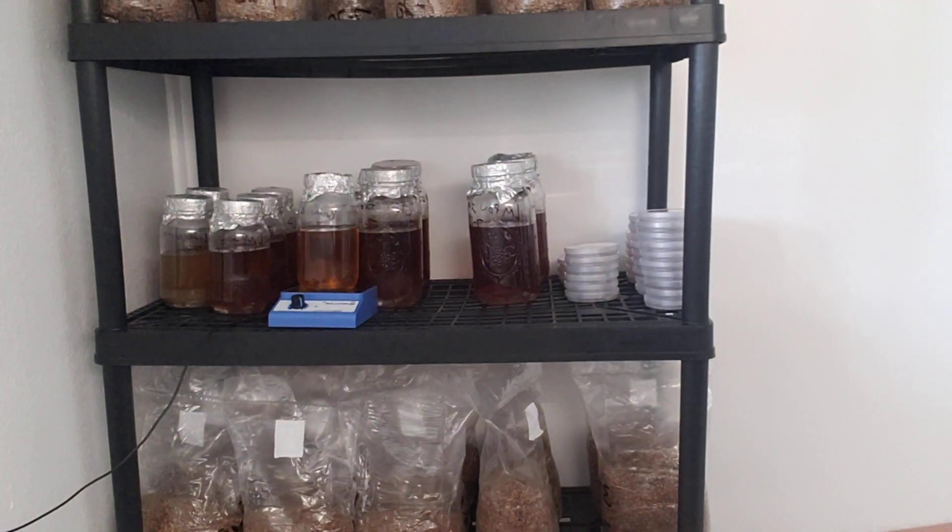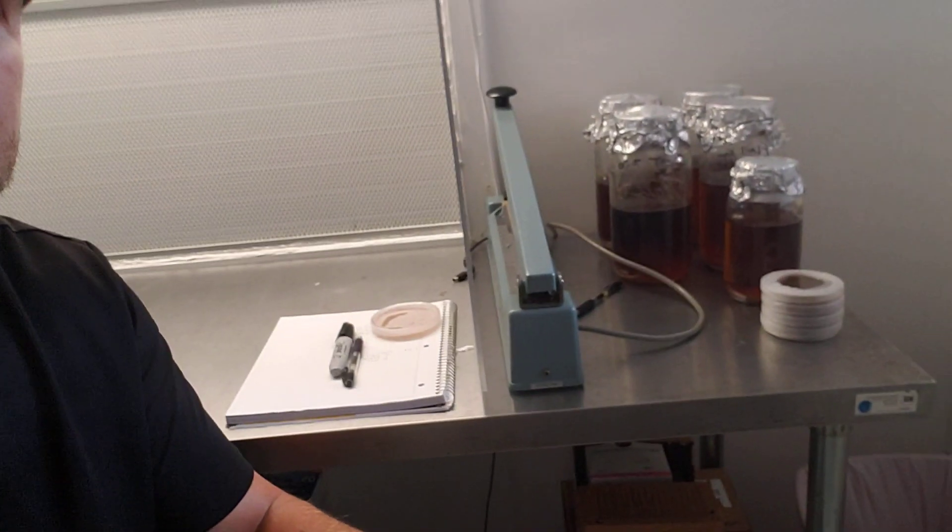The major points of this video: one, give you guys an update on my new lab where I'm going to be doing all my culture work, all of my G1s, and the liquid culture I'm using. I've been screwing around with liquid culture and so far it's working great. I'll make more videos on it as I go along. I've got lots of liquid culture — probably five gallons worth in here. Plate check every batch so you know if it's good or bad. It's incredibly easy to plate check liquid culture, as opposed to plate checking spawn, which is a royal pain — you have to seal the bags and heat the grain out onto a plate.